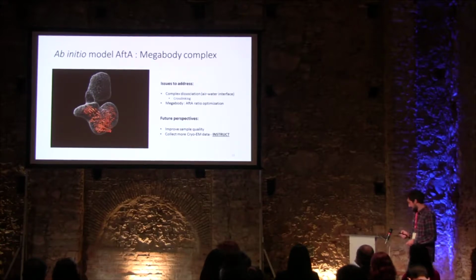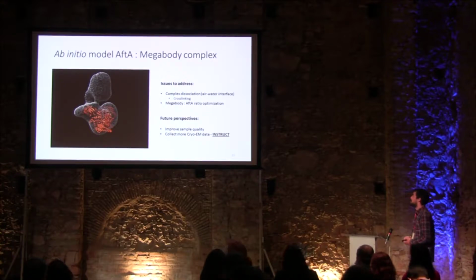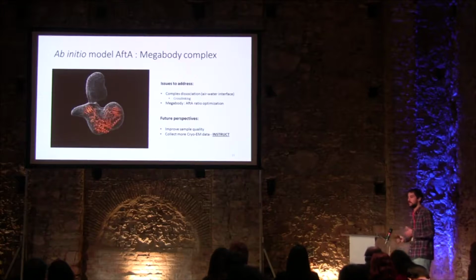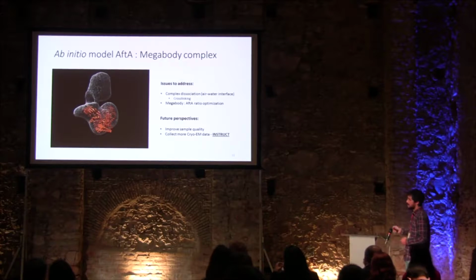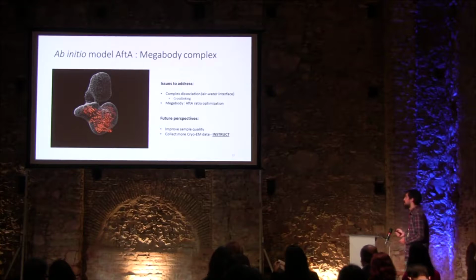So, as future work for this AFTA, we would like to improve the sample quality, maybe increase the ratio of AFTA to try to get more population that does have AFTA in there, and collect more data, like more cryo-EM data. For that, we rely on Instruct centers.